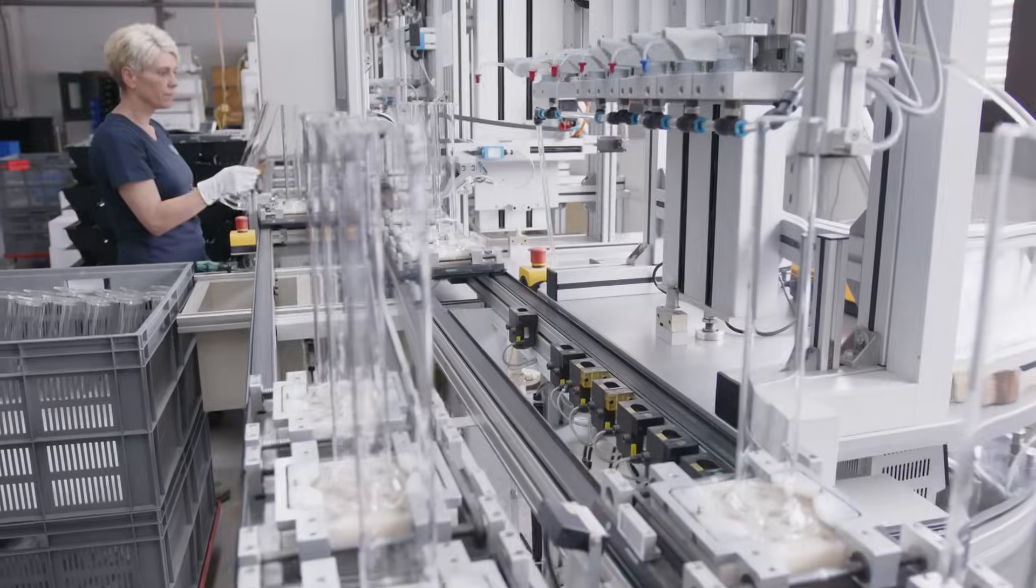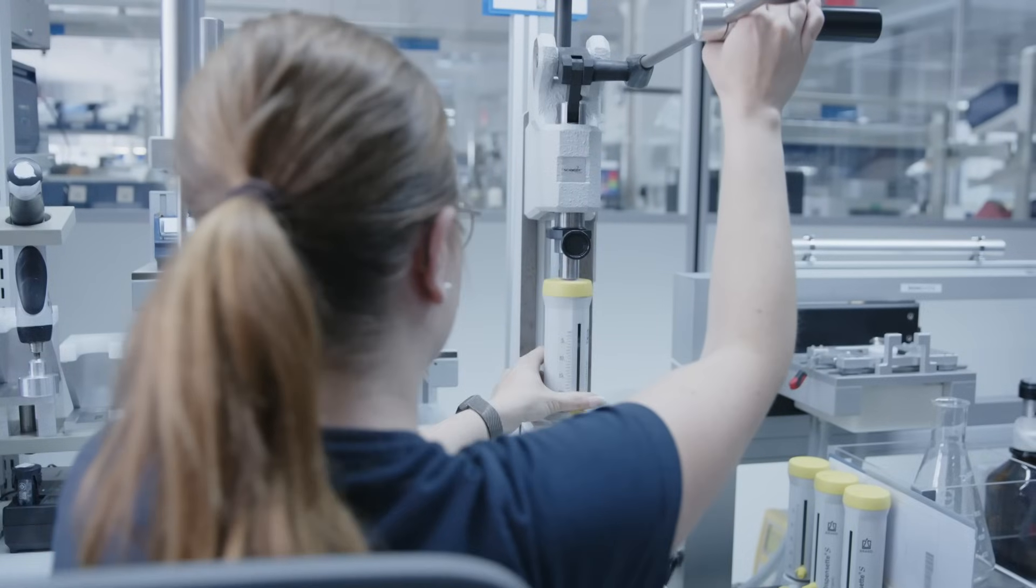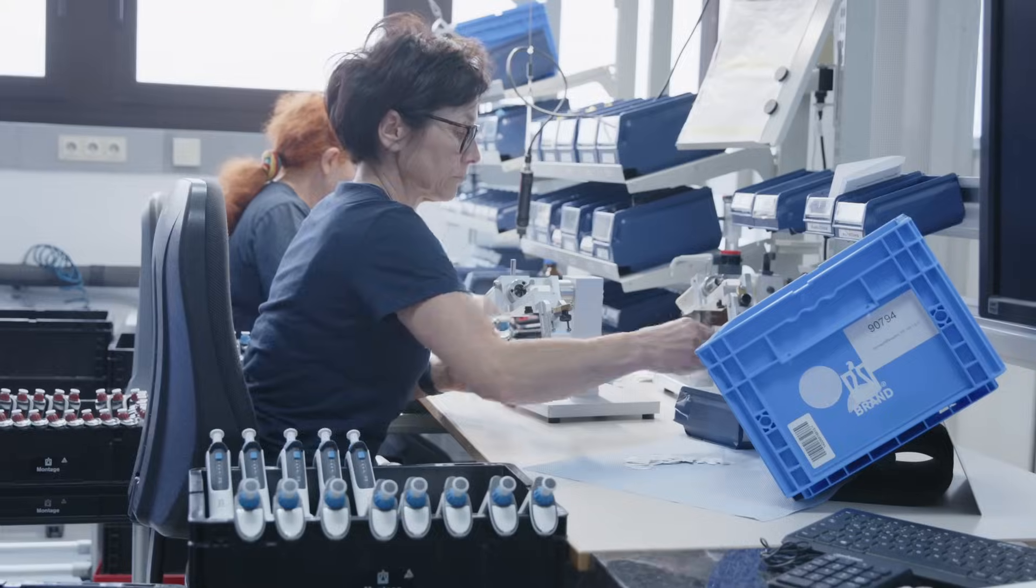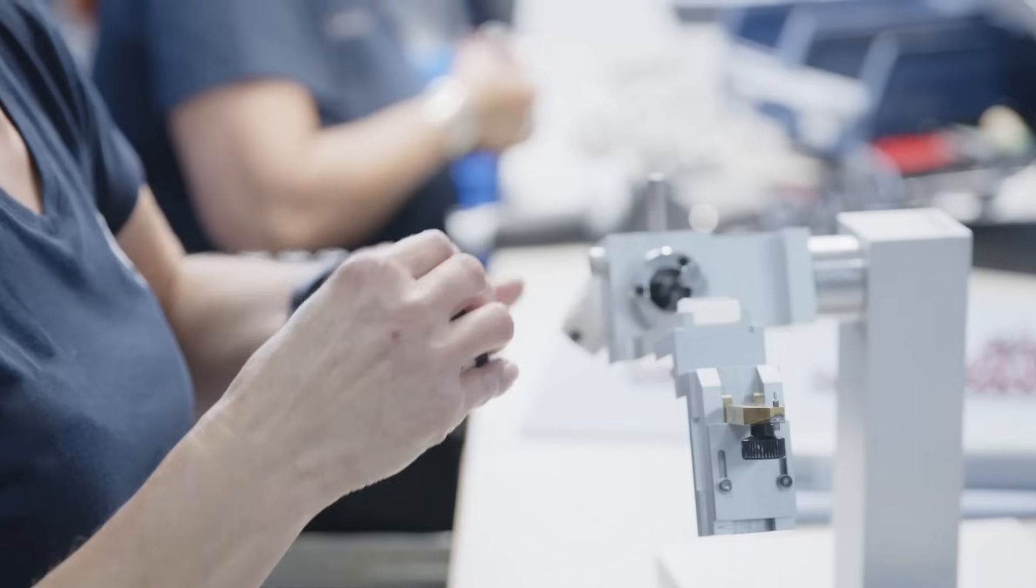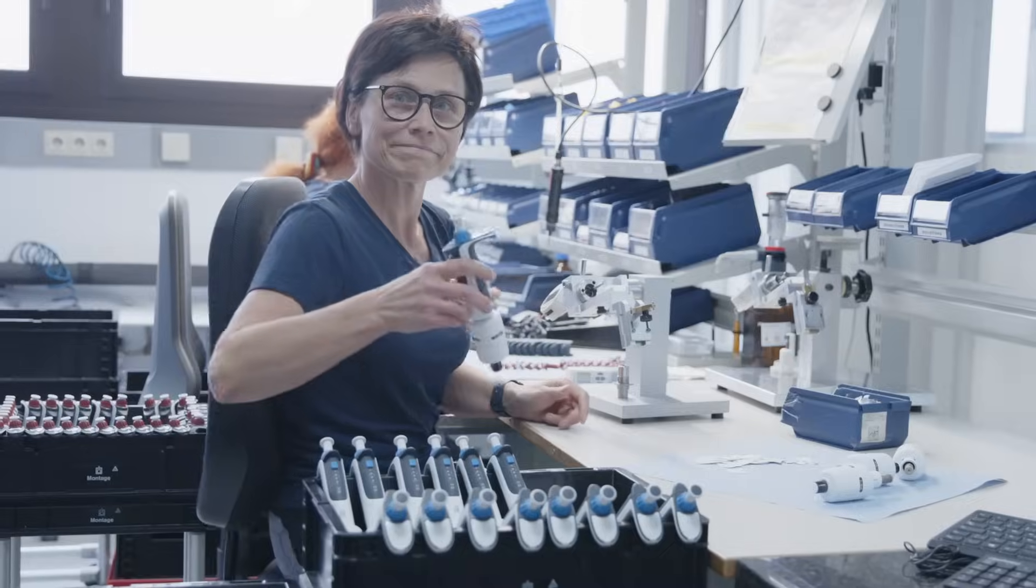Each volumetric instrument is individually calibrated. Our instruments go through rigorous testing on our bench before they are ready for your workbench.